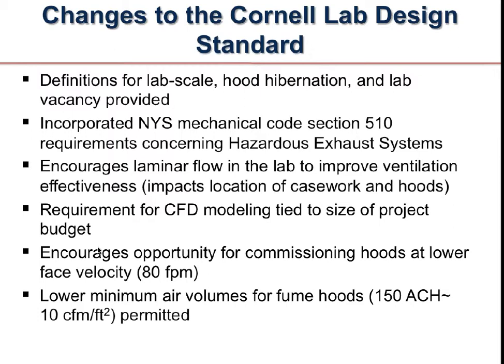Unless we have to take a look at the expected use of the hood, and then we'll actually have a minimum airflow that's probably going to be higher, but for the most part we're going to lower the minimum volumes.